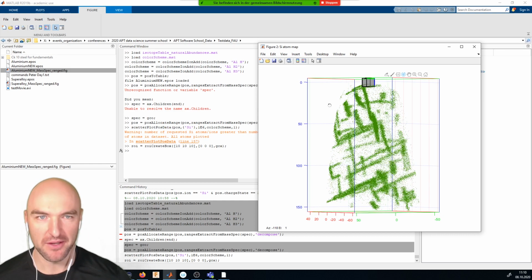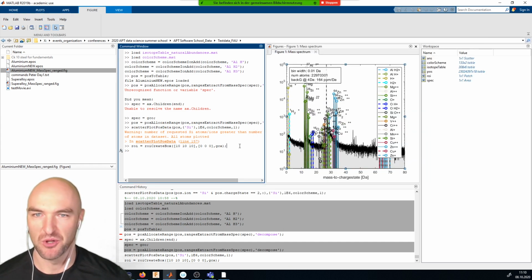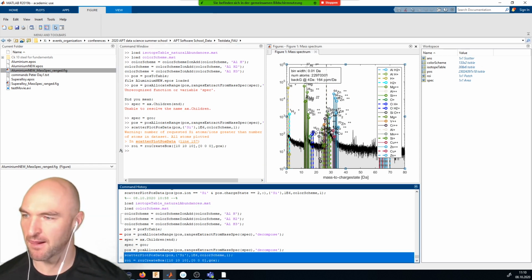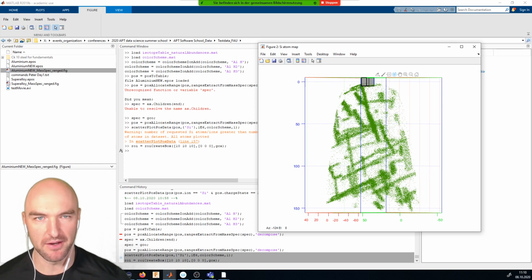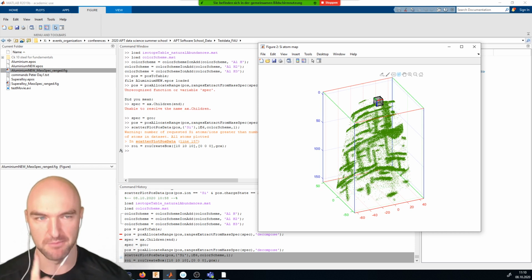Anyway, so now we have a cube sitting here, and that cube is not super helpful, because it just sits somewhere up there in the corner and we can't do much with it. What we can see obviously here is that if we use a box, we can see the coordinate system of the box. So the coordinate system of the box starts in the corner, and that is important, okay?